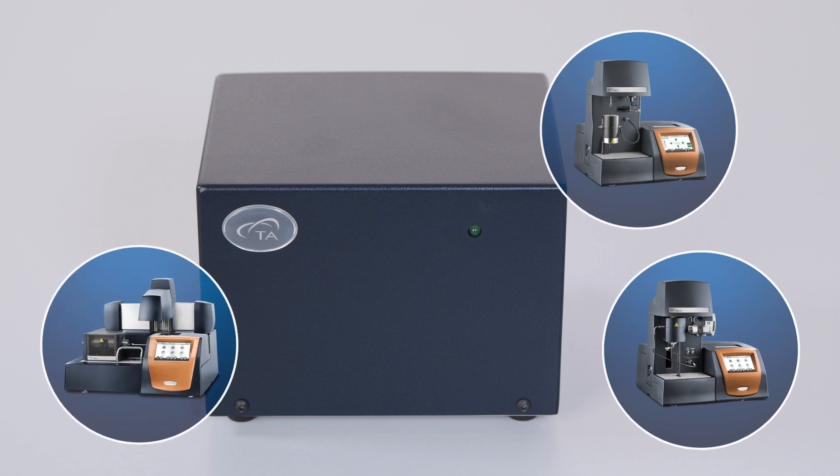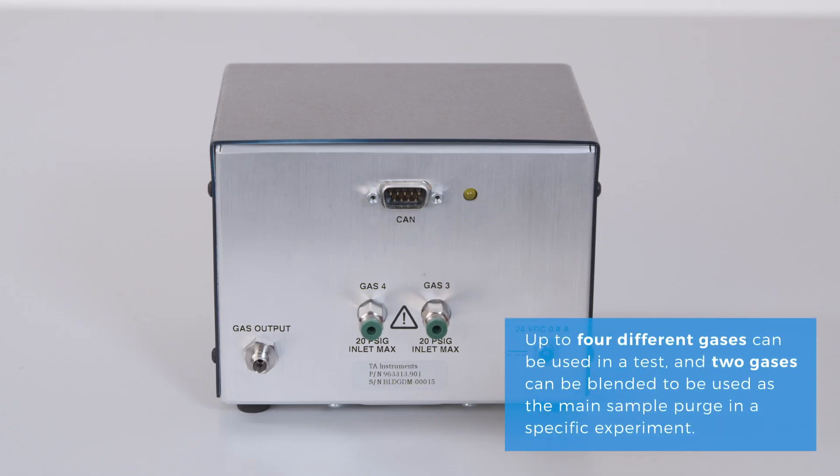With this software-controlled accessory, up to four different gases can be used in a test, and two gases can be blended to be used as the main sample purge in a specific experiment.